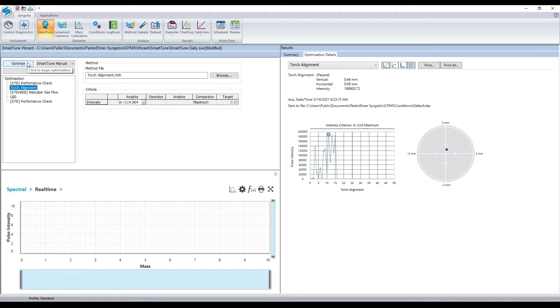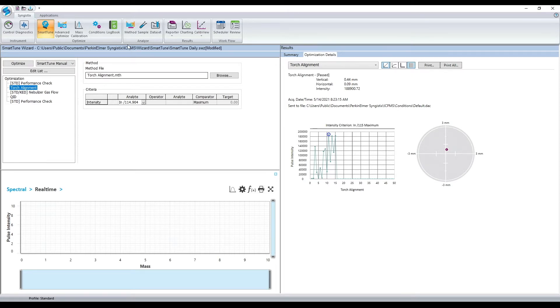Now that optimizations are complete, the software will produce a hard copy of the performance check report and provide all the detailed information of the optimizations. In addition to providing an optional printout of the performance check data, Syngistics records the performance data into its internal logbook.